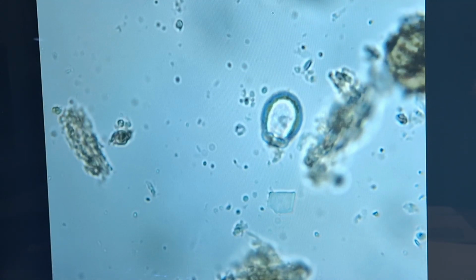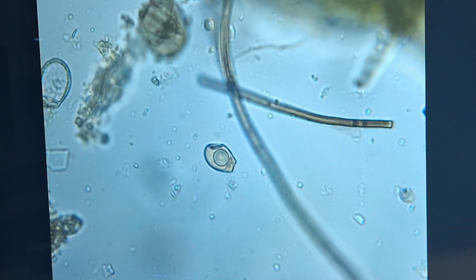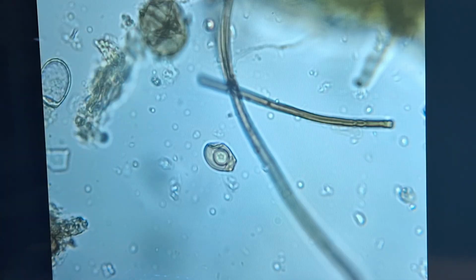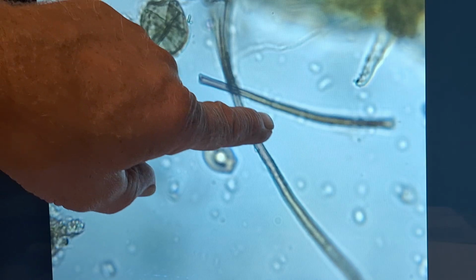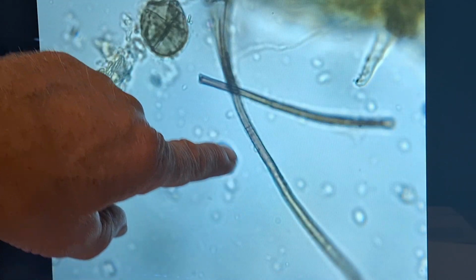And I believe there's another one right next to them. Yeah, right there. There we can see another one. Real good look at that one's moving around right now. Zoom in, we can see those septa real well, and the fungi, the fungal hyphae, the breaks.